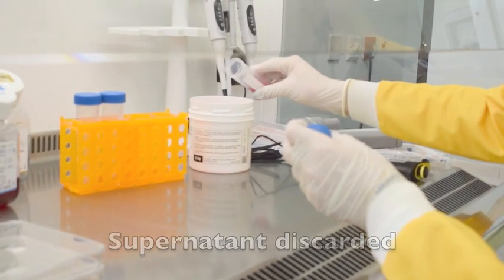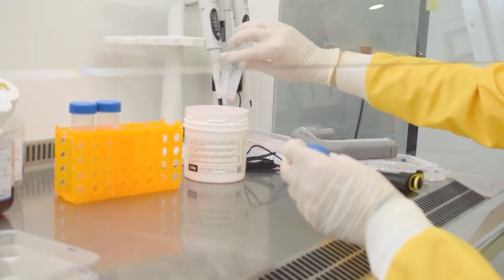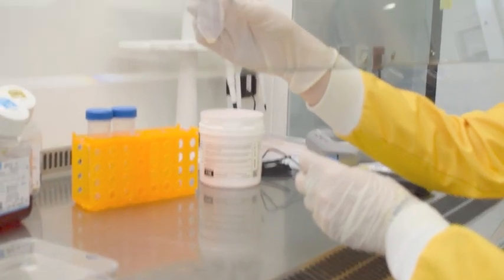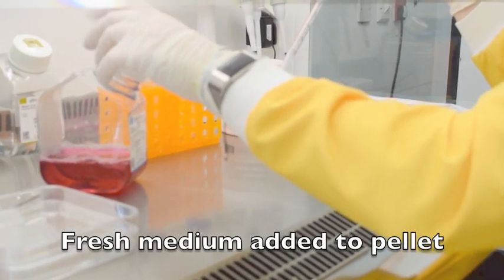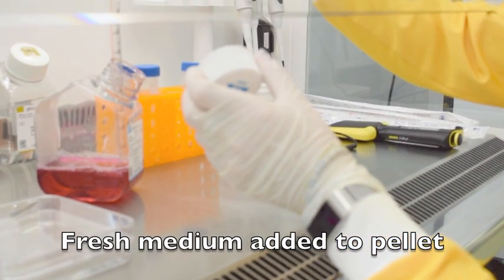The supernatant is then discarded by pouring, leaving the cell pellet at the base of the tube. The cell pellet is then resuspended in fresh medium.